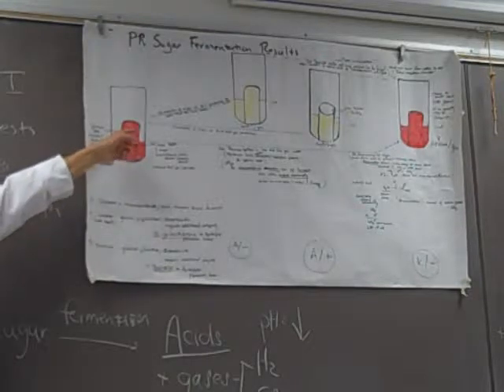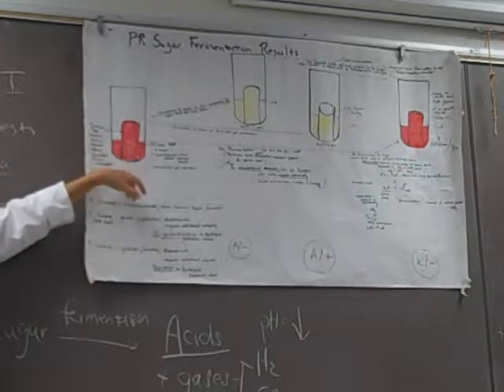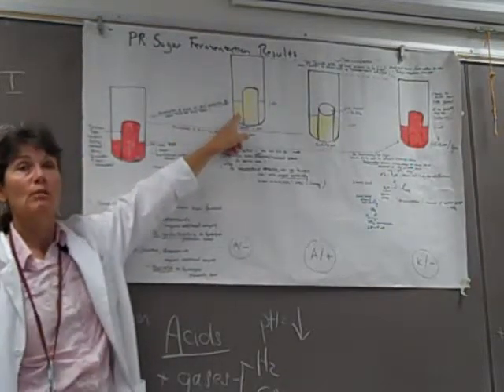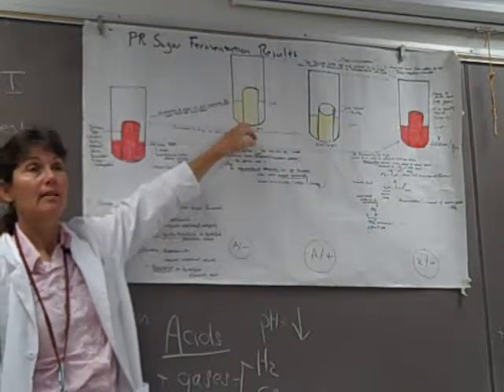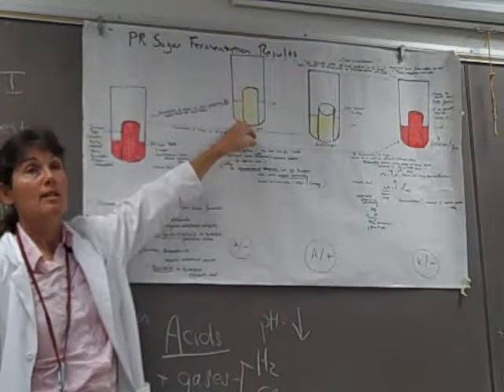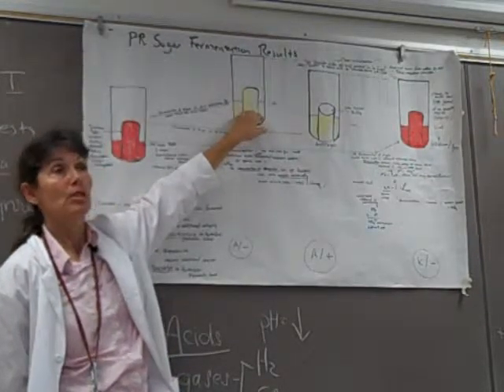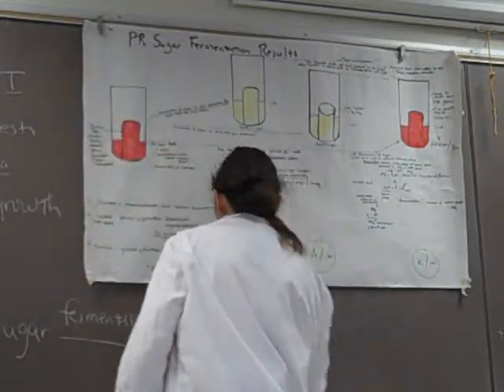Now let's presume we have a microbe that can carry out fermentation of the sugars with acid production. So when you pull your tubes, then on Tuesday you would expect to see the media is yellow, indicating an acidic pH, right? Now some microbes lack the extra enzymes to make gases, so we could see just acid production without any gas. And we've got a scoring system for this.